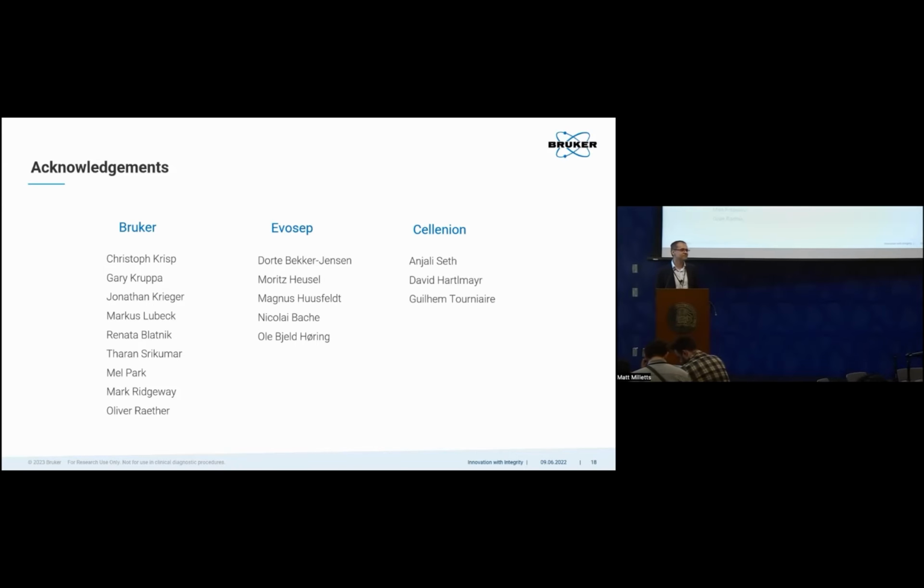Very cool technology. My question is on linearity and dynamic range. Are there some good studies you could point us to that have tested this? Do you see 2 times more signal when you have 2 cells, 3 times more signal with 3 cells? And is there a difference in the linear dynamic range plus or minus the TIMS?